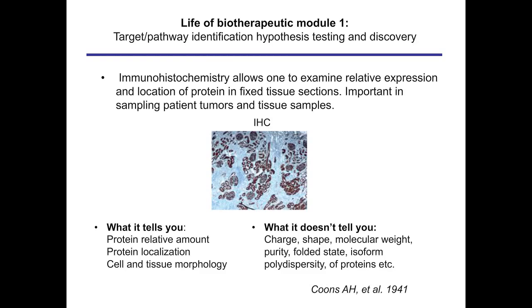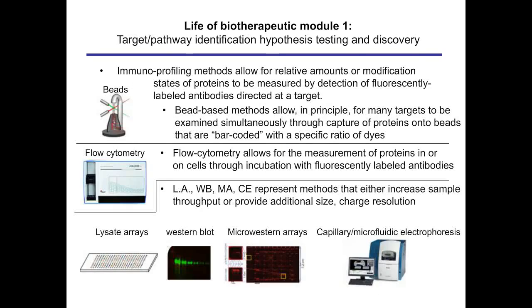But it doesn't tell you charge, shape, molecular weight, protein purity, folded state, isoform, or the polydispersity, also known as the size range of the proteins. And so these other pieces of information will have to be gleaned with other protein analysis methods. This is a quite old method, originally described in 1941.